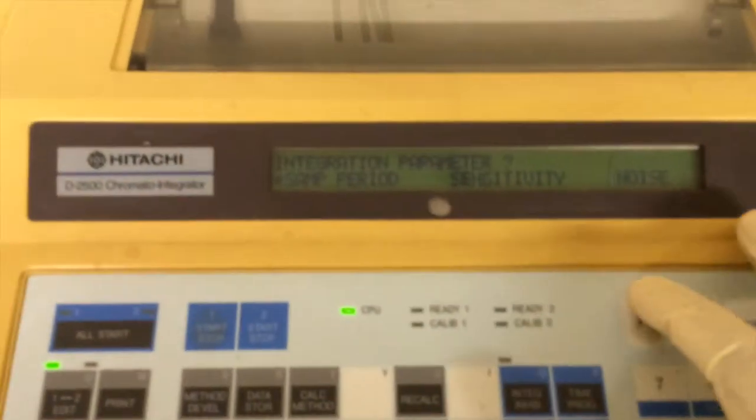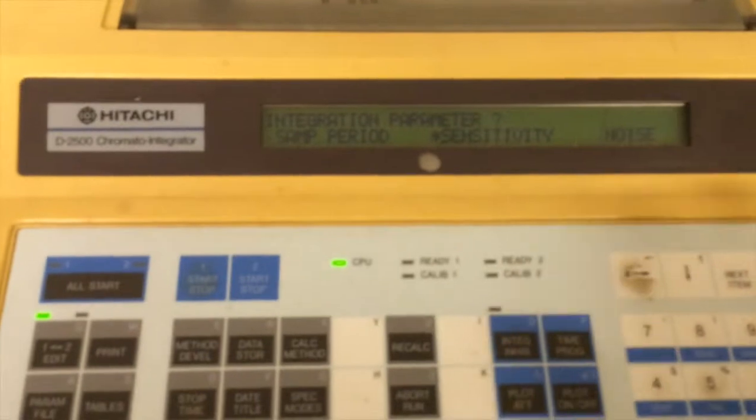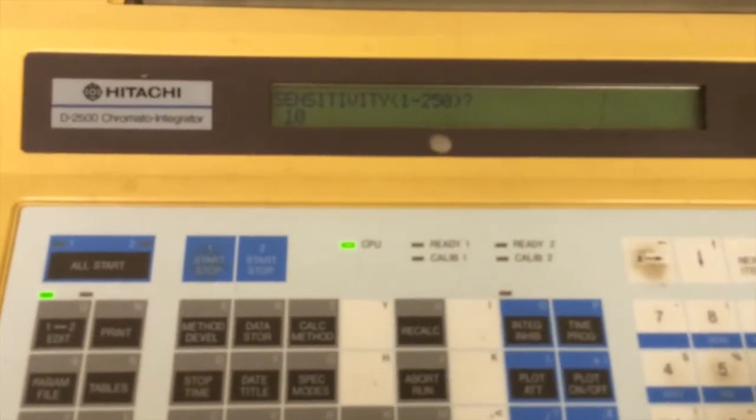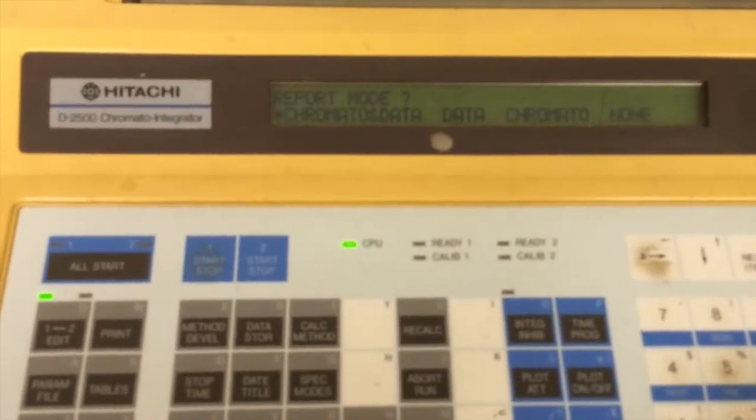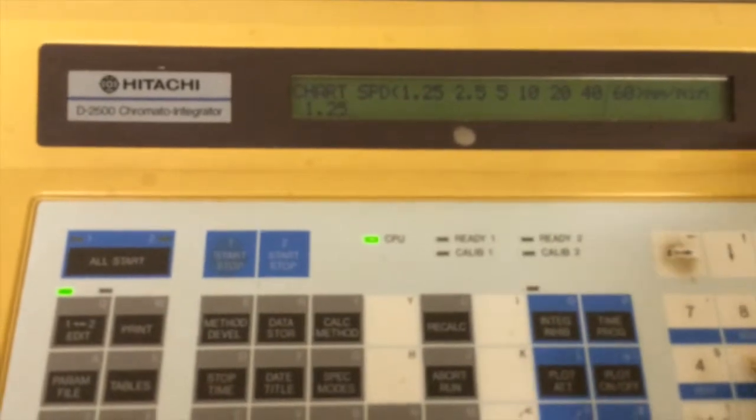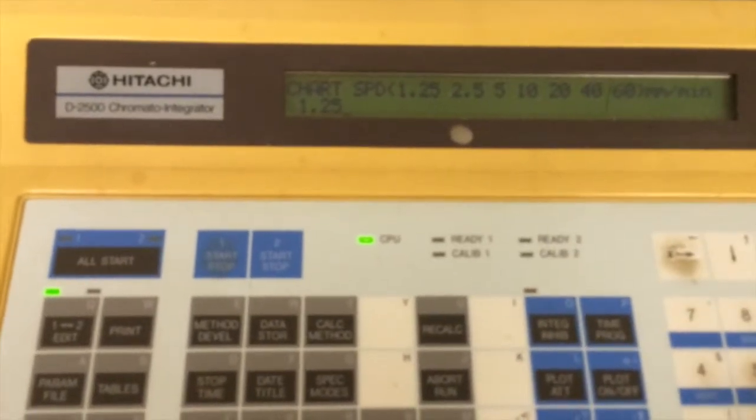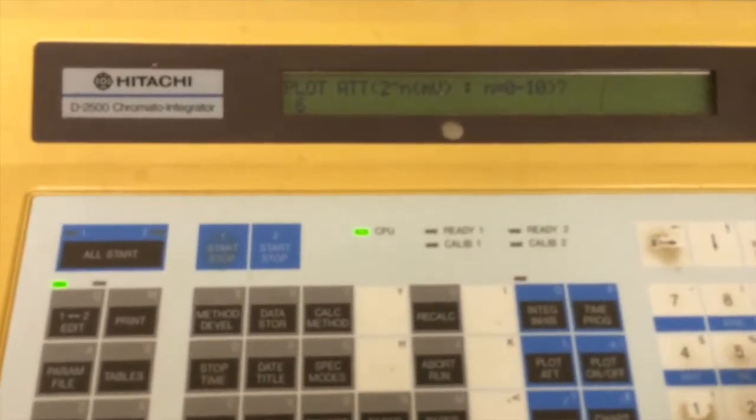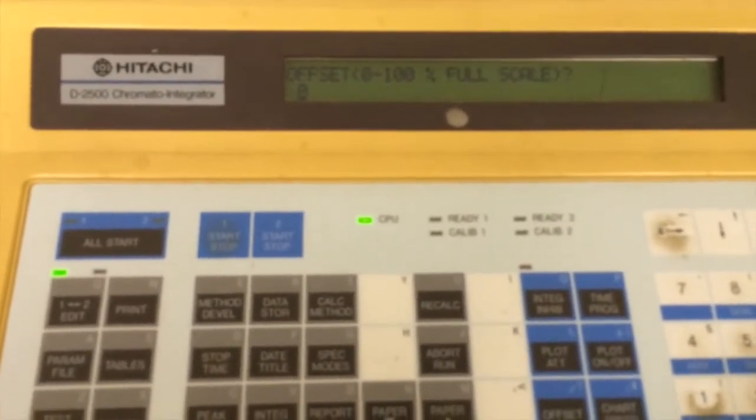Period sensitivity - ten is now, this is 1.25.